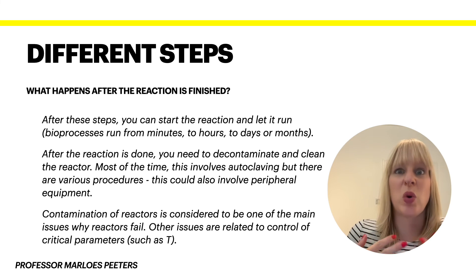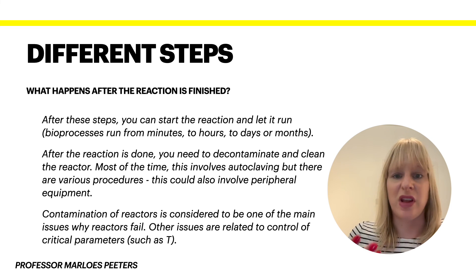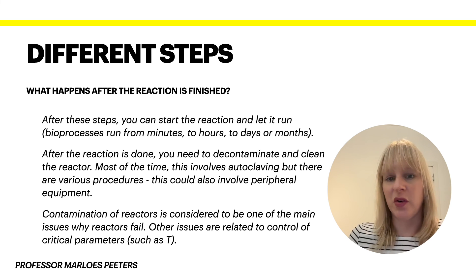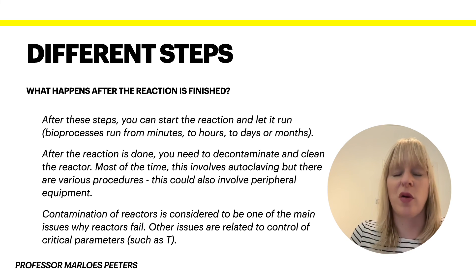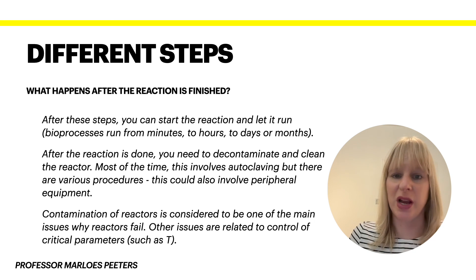This brings us back to the two main reasons your reaction might fail. First, contamination — that is a big thing. Second, issues related to control of critical parameters, such as temperature going off during the reaction. You would have sensors monitoring that, but sensors also have a failure rate, so they could stop working — which is why you often have more than one sensor in different places — or you might not have intervened soon enough and picked up the problem too late. When working with a live system you must act within appropriate timeframes. Mammalian cell cultures have a very slow doubling time, so you may allow yourself more time, but fast-growing organisms require far more frequent monitoring.